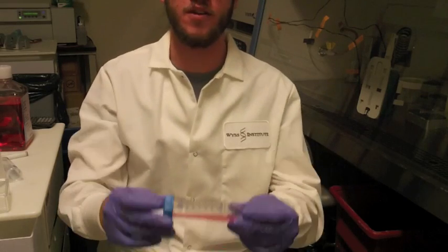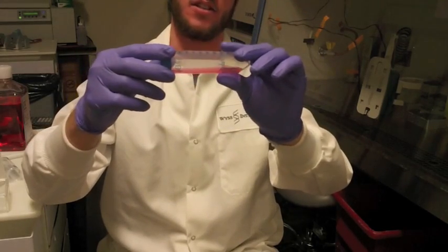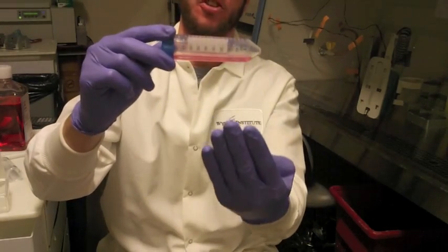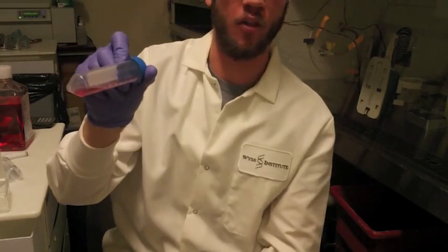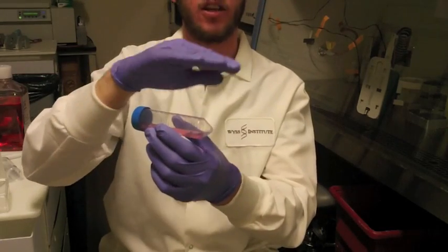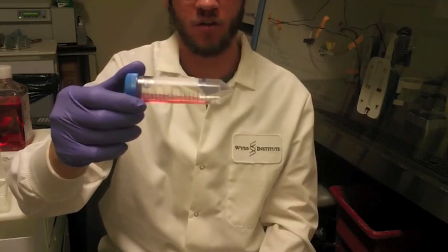So the final concept ends up looking something like this. A cylinder with cells and media in a thin layer on the bottom is slowly rotated by an actuator, represented by my hand here, which reveals new area coming down the front and pulls dead cells, which are still stuck to the side, up and out of the media on the back. A brush at the top would then clean the dead cells off before it rotated around to reveal new area. So this gives the cells all the room they need to grow.